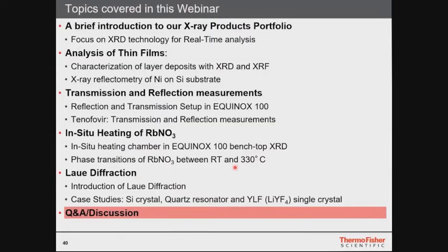So you always have to shape your beam somehow. In classical Bragg-Brentano instruments, usually you use a filter to get rid of the K-beta radiation, because each of the energies in your radiation will yield a signal.